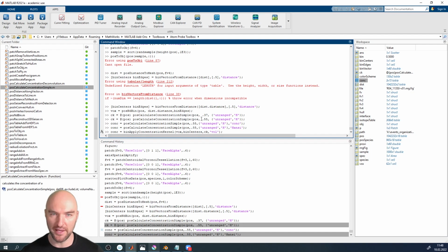And by the way, everything that you pass, so here you can see this @ sign. Any of the things behind that @ sign are the variables that we are passing to this function when we execute it. If we put 0.55 here, then we have said, okay, when we invoke this function through this function handle, it's always this 0.55. So we don't need to repeat the 0.55. We don't need to repeat the unranged, and we don't need to repeat the volume name if we've assigned any, but we haven't assigned one for a voxel. But you could do that.